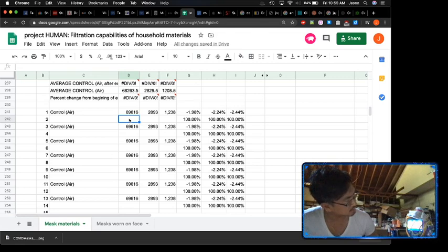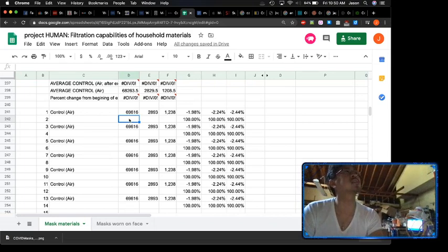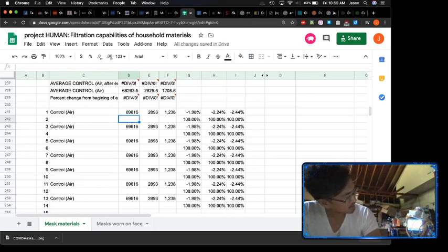Insane. I mean, look at those counts. That's fucking nothing. Man, this 3M stuff is insane. I don't know if you guys can see the screen. I highly doubt it. But the counts are like 32, out of 70,000 0.3 micron particulates in room air.